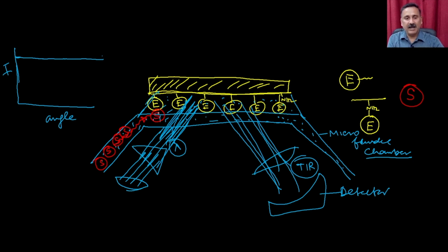As soon as it binds the enzyme, there will be a change in the absorption pattern, and because of that you are going to see the absence of light. So you are going to see light which is absent in this particular light beam, and as a result it is going to show you a dip, and then again it will come back.